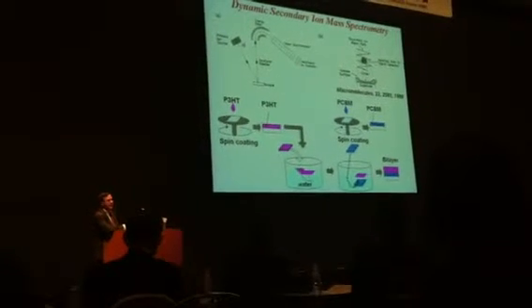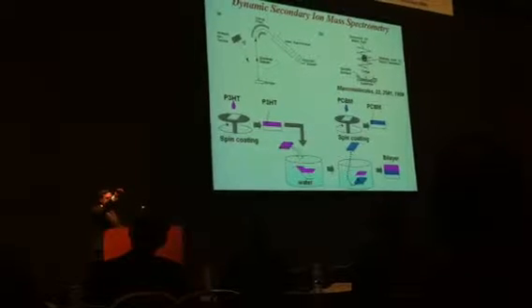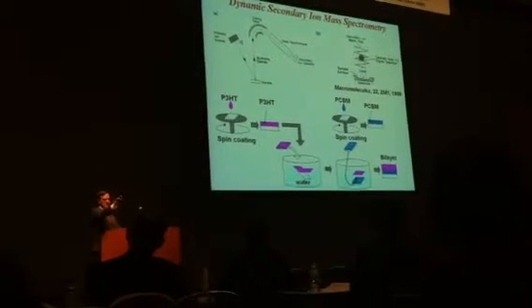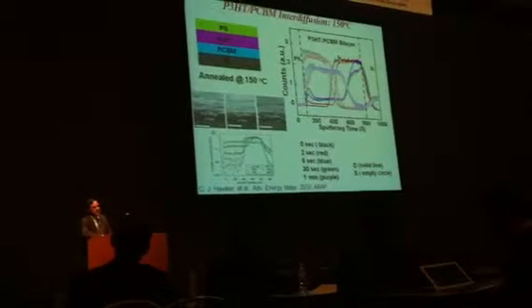And so now we have a bilayer of P3HT on top of PCBM, and we actually put a sacrificial layer of polystyrene on the surface. And the reason we do that is that we want the ion beam, when it's etching into the material, to establish a constant sputtering rate so that time now corresponds to depth. And if you do this, there's a stunning result that emerges.